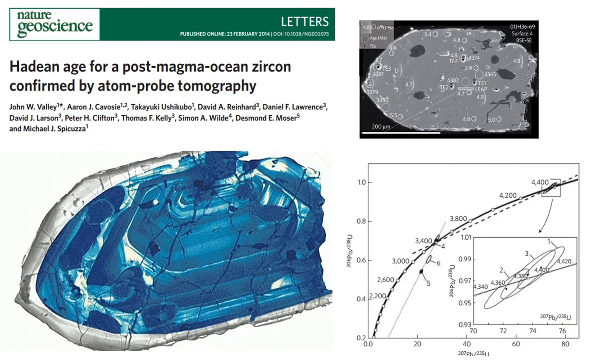Okay, so this is an example of where this SIMS, or secondary ion mass spectrometry, technique has been used. This is a zircon crystal from Australia, and this is one of the oldest things on the Earth. This is a 4.4 billion year old zircon crystal. And the interesting thing is that this is a cathodoluminescence, kind of falsely colored image. And you can see that this is the zircon crystal, so the whole thing is the zircon crystal.